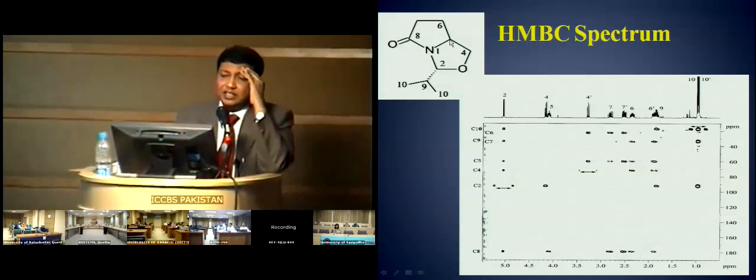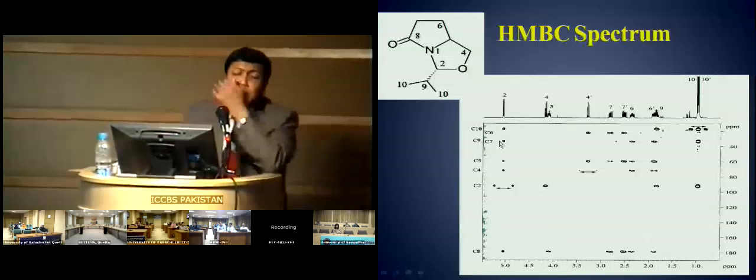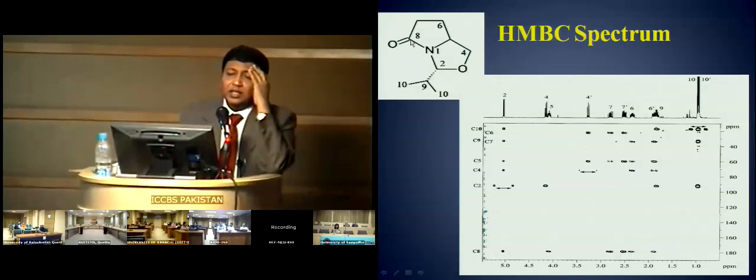I don't know where C7 is. This is C9, I'm sorry, this is C9. Okay, C9, and then you have C5. H2 is coupled with C5, H2 is coupled with C4, 1, 2, 3, and H2 is coupled with C8, right? This with this quaternary carbon, this carbonyl carbon.